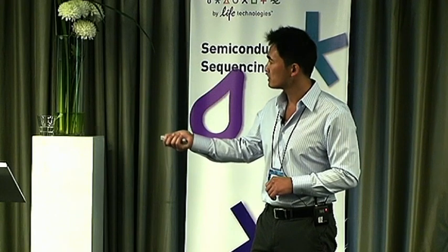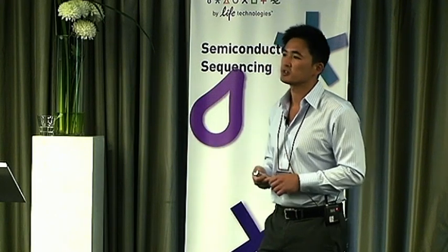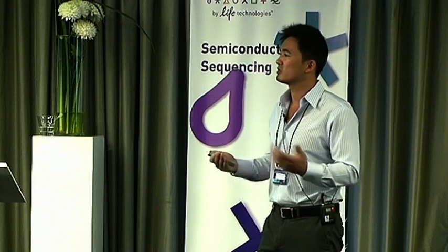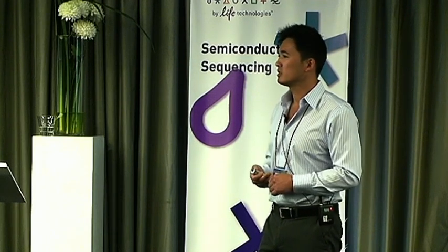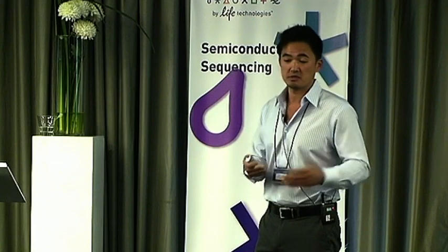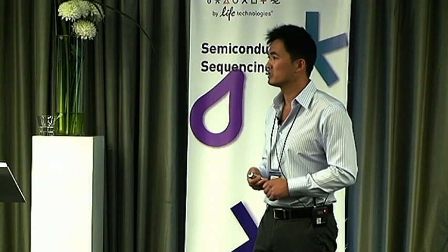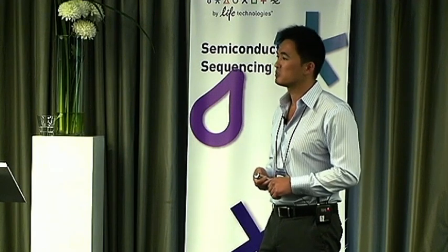So these were actually released, and I think these would be of tremendous interest to anyone that's involved in biorepository work, sample tracking of large patient cohorts, trying to go back and validate and say, okay, we know the sample is patient 654, number 6 on the list, because we confirm it with the SNP genetic barcode.